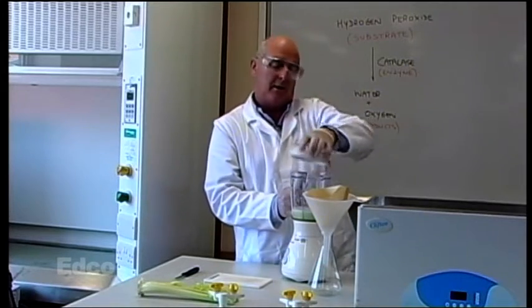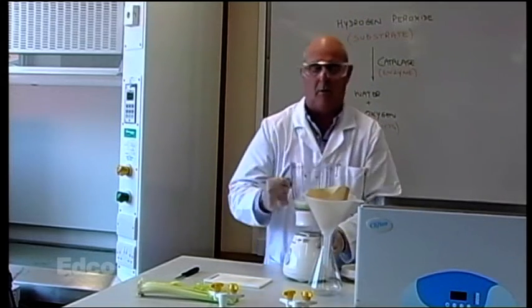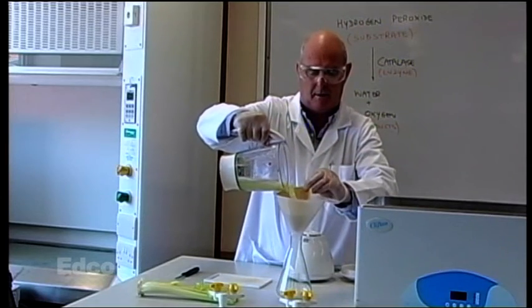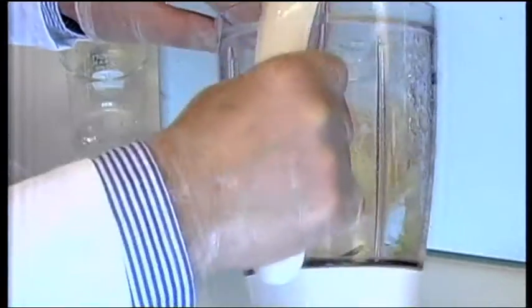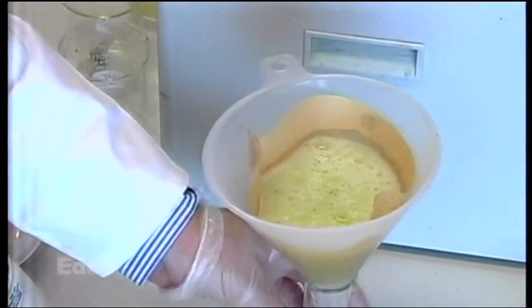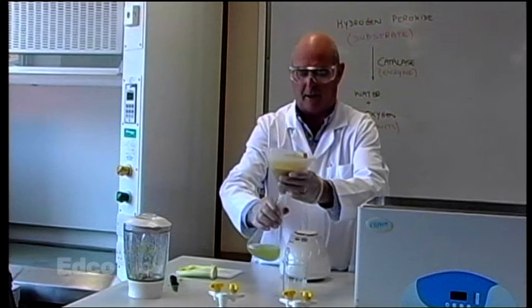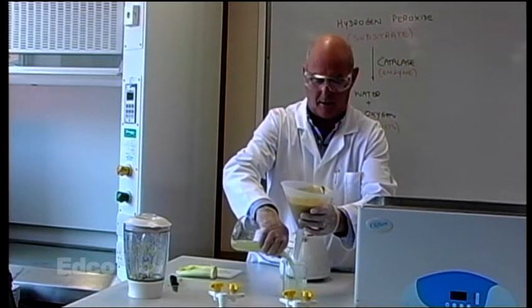To remove all the cell debris and the cell parts, etc., we pass it through coffee filter paper. And that will give us our enzyme here. The filtrate will be our enzyme. We transfer the filtrate containing the enzyme to a beaker.